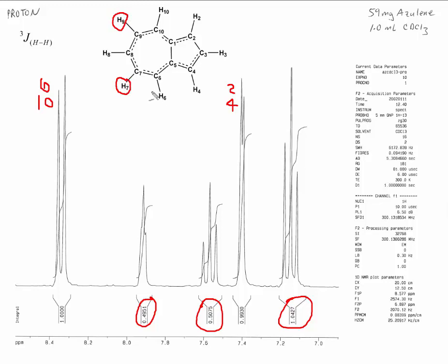The other triplets are H8 and H3. They're single atoms. And so we know without any further analysis that we can assign 7 and 9 as this peak simply because of the value of the integral there.